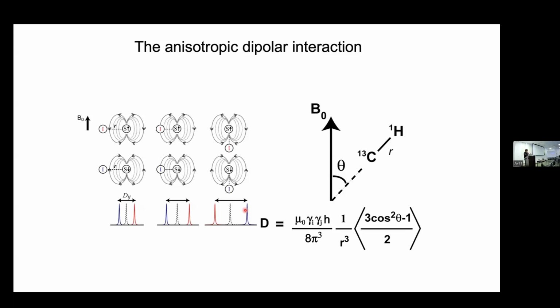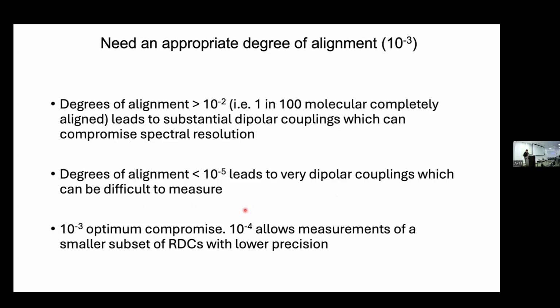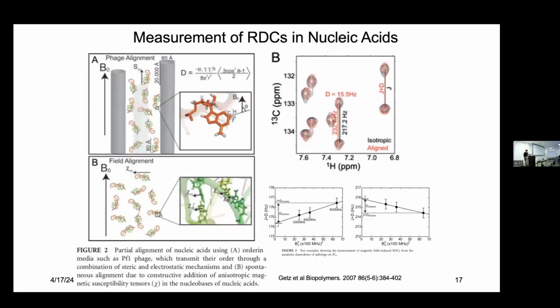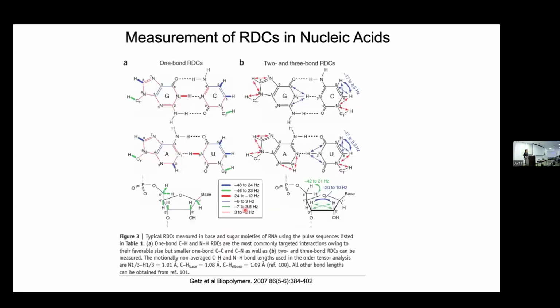So it's not a trivial thing, is what I'm trying to say. The nitrogen magnets are better than carbon. Just because for the CH bond the RDC is bigger doesn't necessarily mean that that's the right quantity to measure. The best things to measure are those that have the biggest magnitude and the best line widths, and they're not always co-aligned, those two factors. Things that get big couplings tend to also contribute to T2 relaxation. And so it's not an obvious thing to move forward. But nevertheless, the general rule of thumb is you care about directly bonded things to protons.